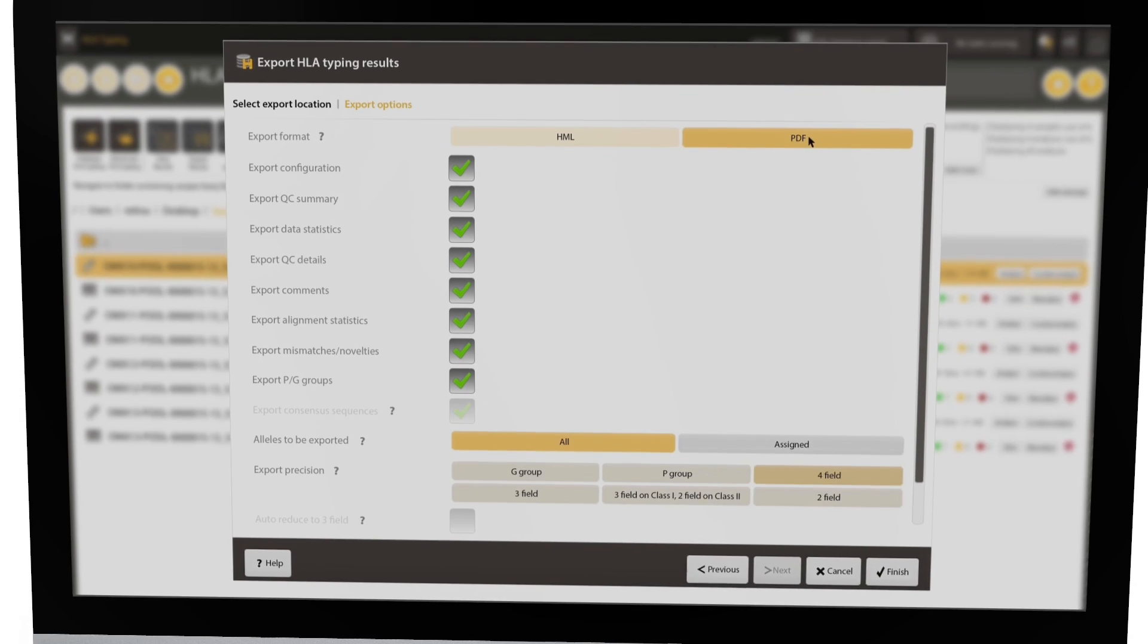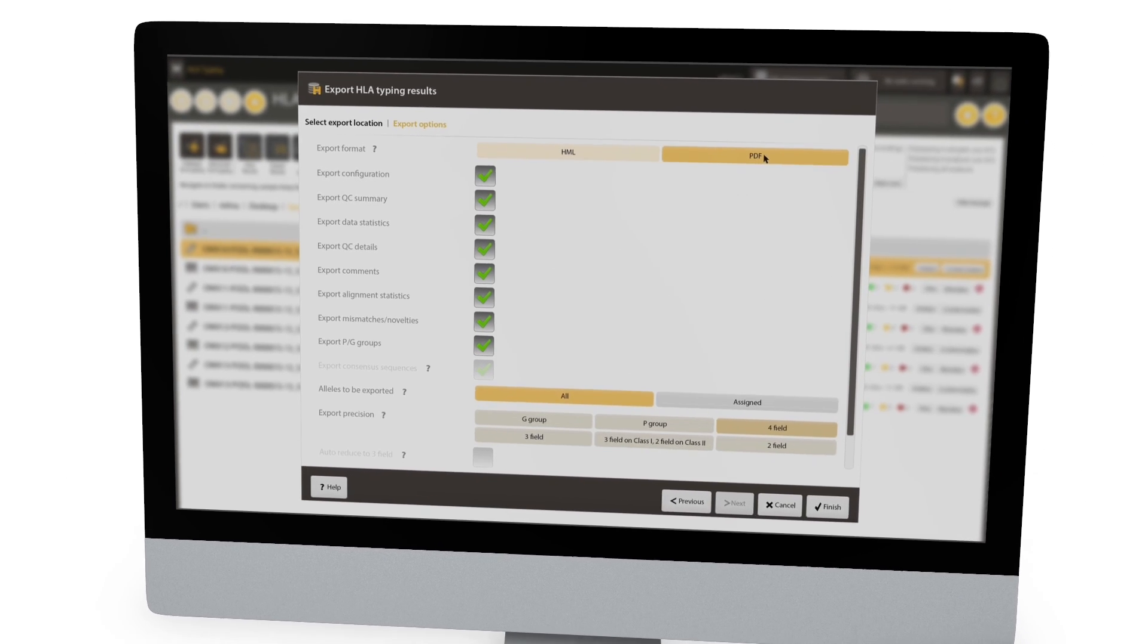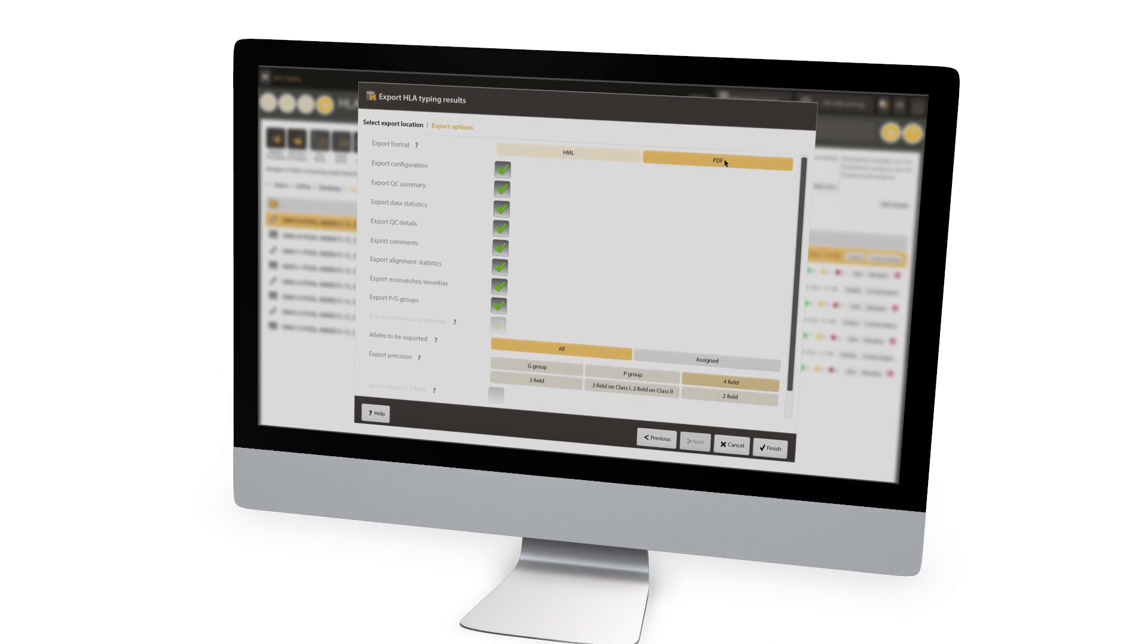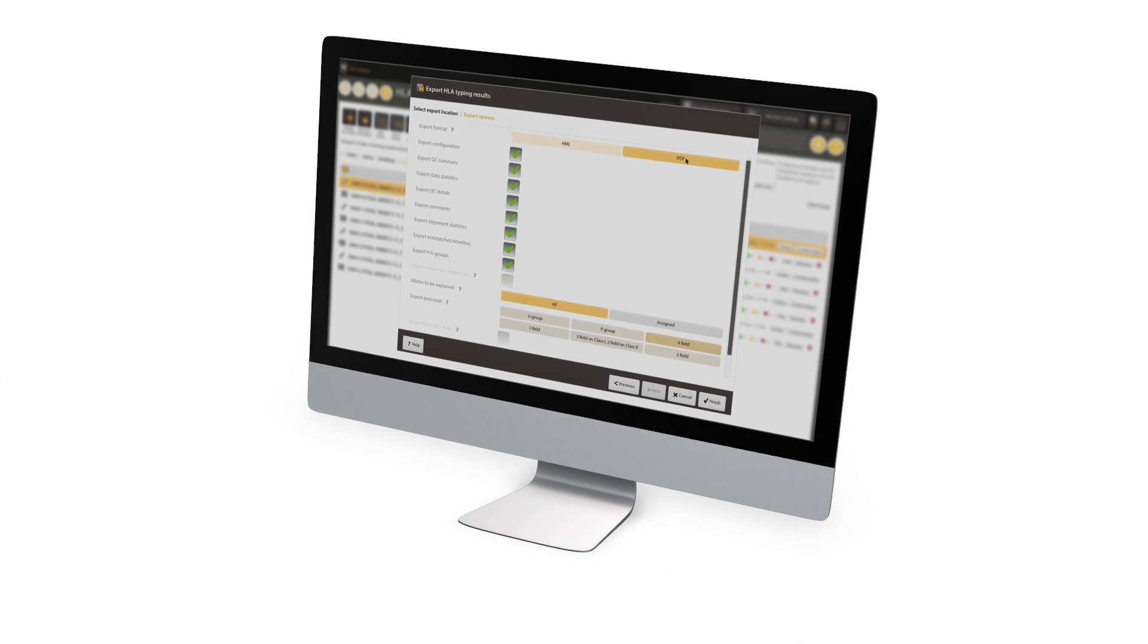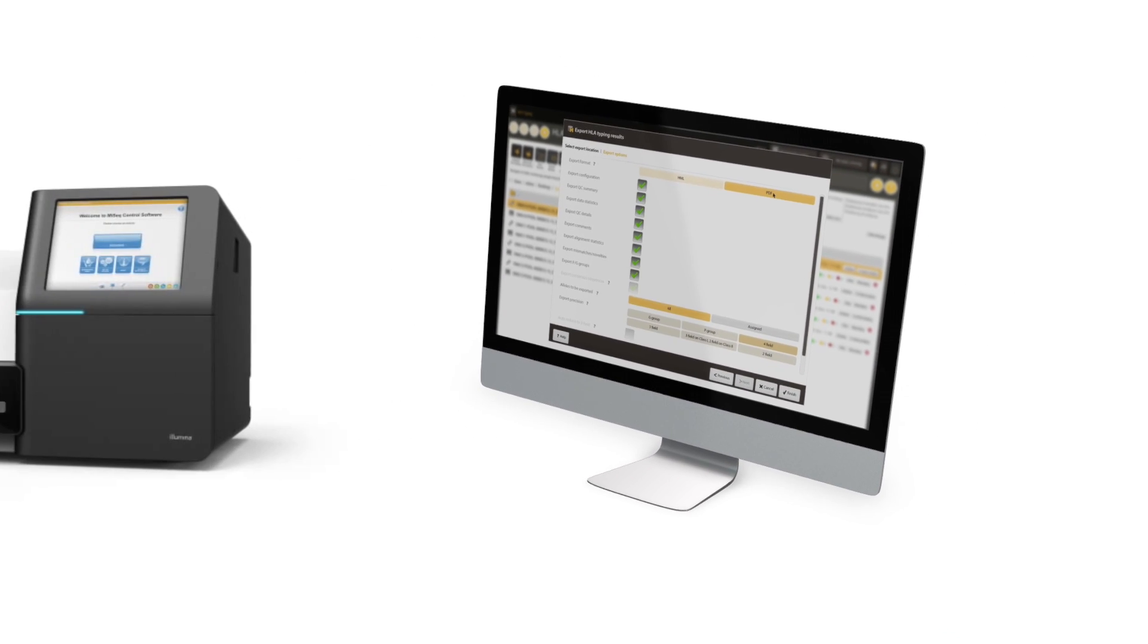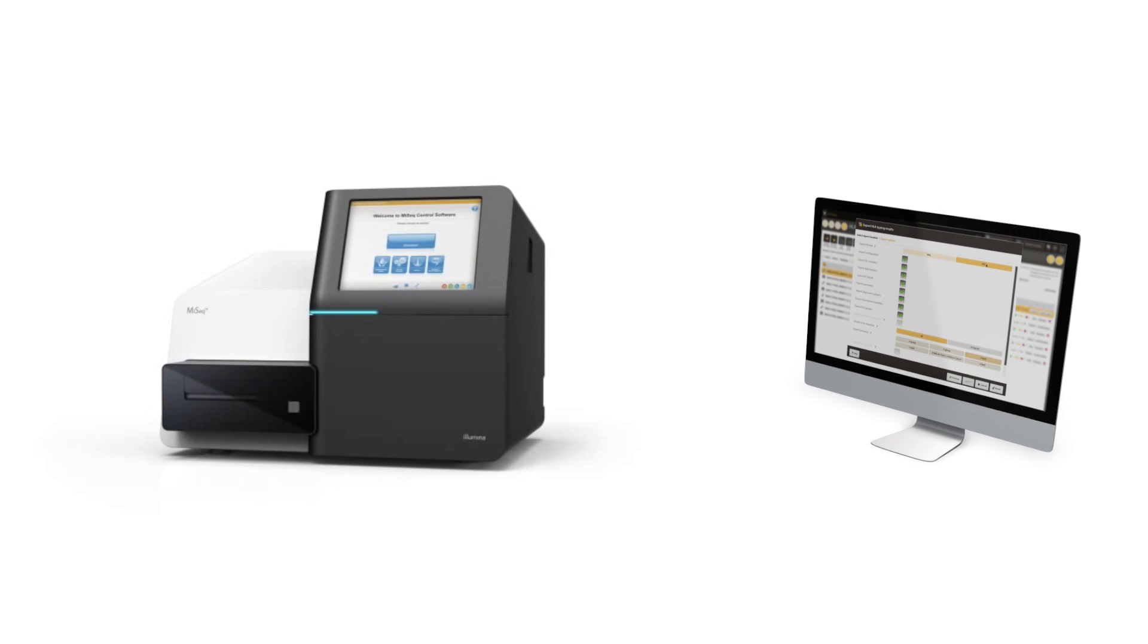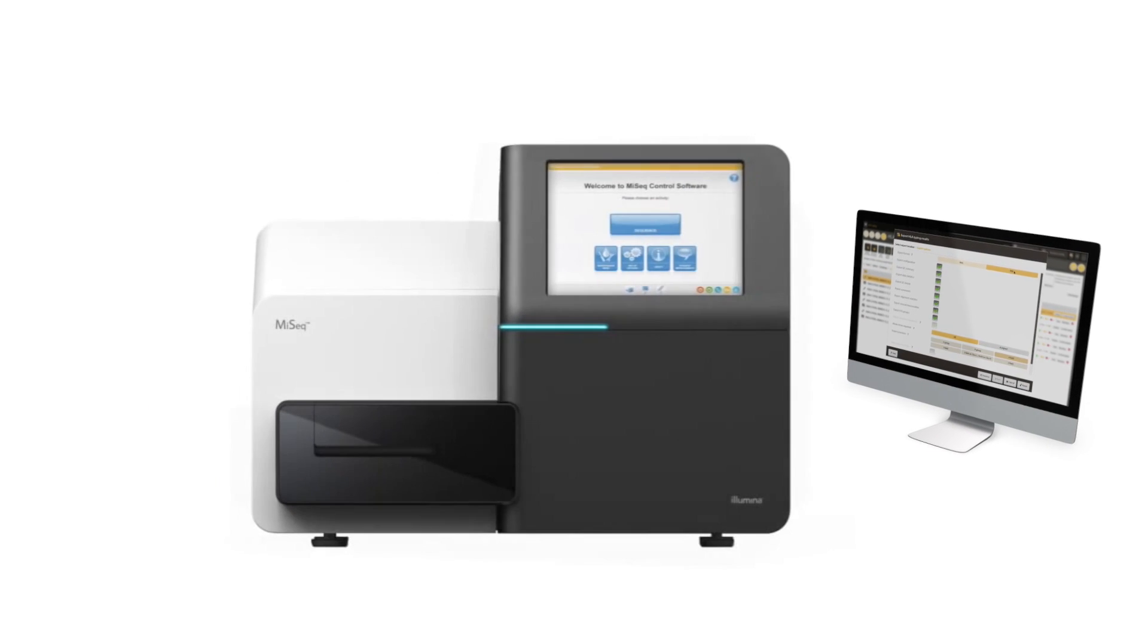When correctly configured, HLA Twin can run without user intervention to process data immediately after the completion of the Illumina sequencer for an end-to-end automated analysis experience.